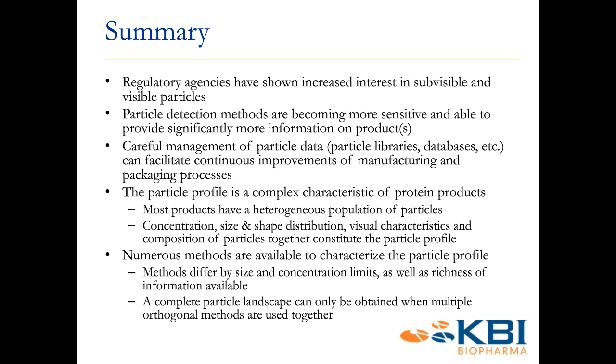But also the particle profile can be a very complex profile made up of certainly more than one identity. For instance, you can have protein particles, silicon oil particles, you could have free fatty acid particles. So understanding which component is contributing to these particle profiles can really help you understand your product and look for changes, real changes in these distributions to help understand stability.